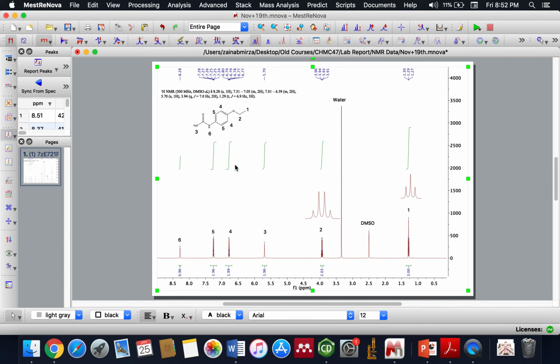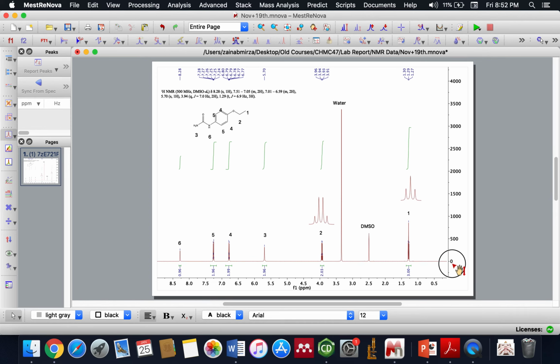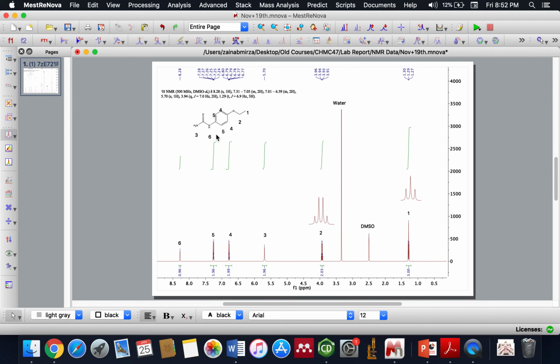So if you want, honestly, you can make the structure a little bigger. That's a little too tiny, but it serves the purpose, and it looked too stretched out. Okay, so I believe we have almost everything. We've numbered it. I believe that should be all. Just going to close these extra things. Oh, you see, if I move the structure up or down, it moves everything.